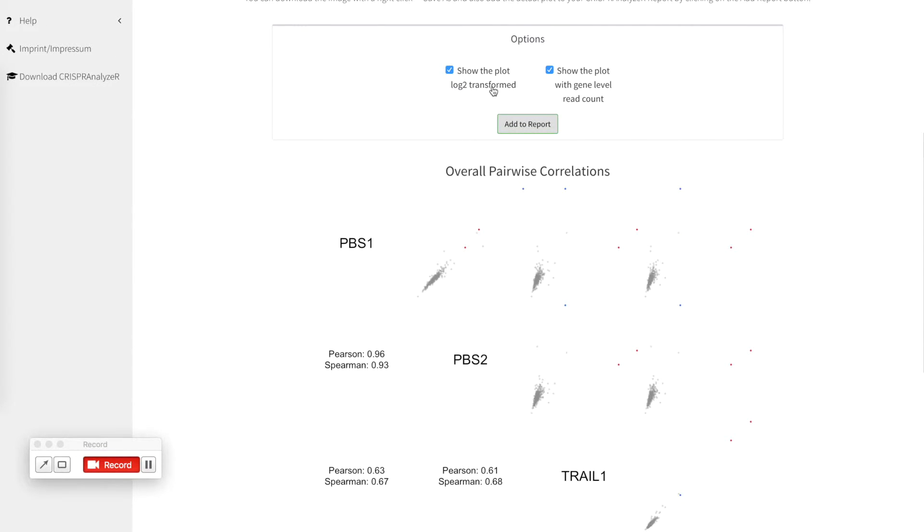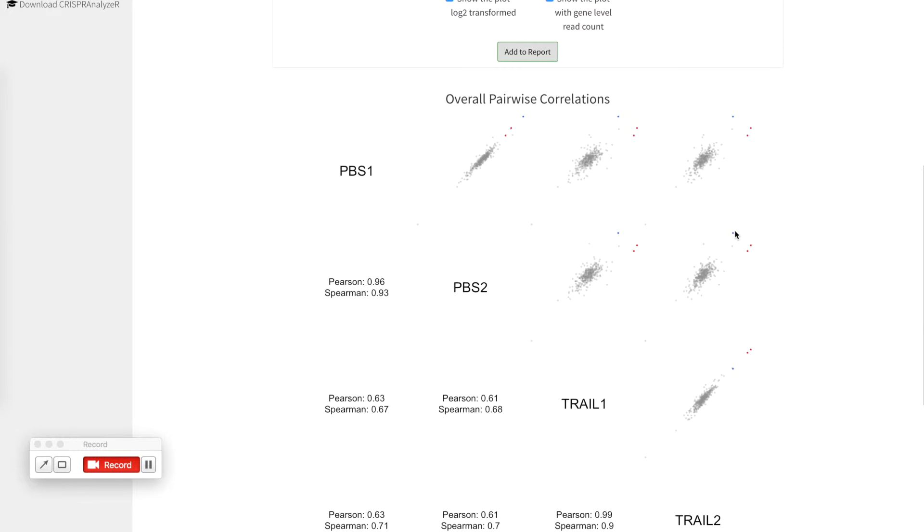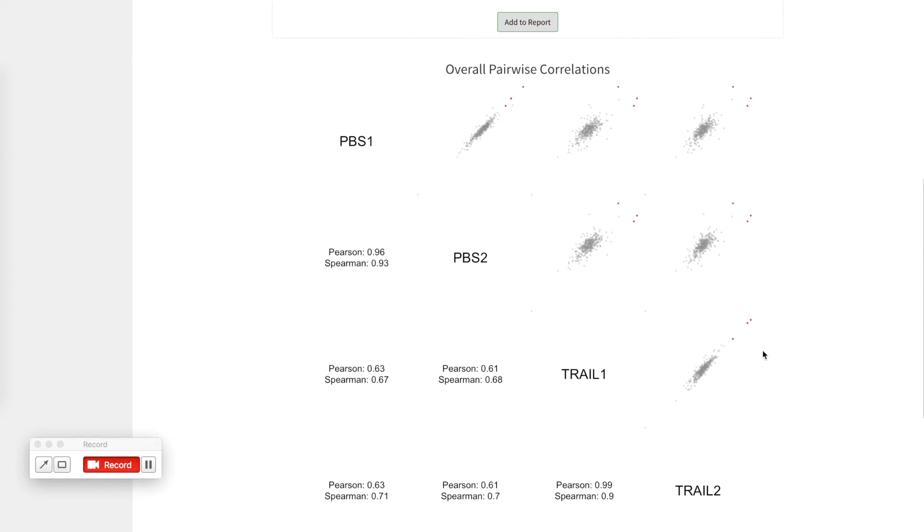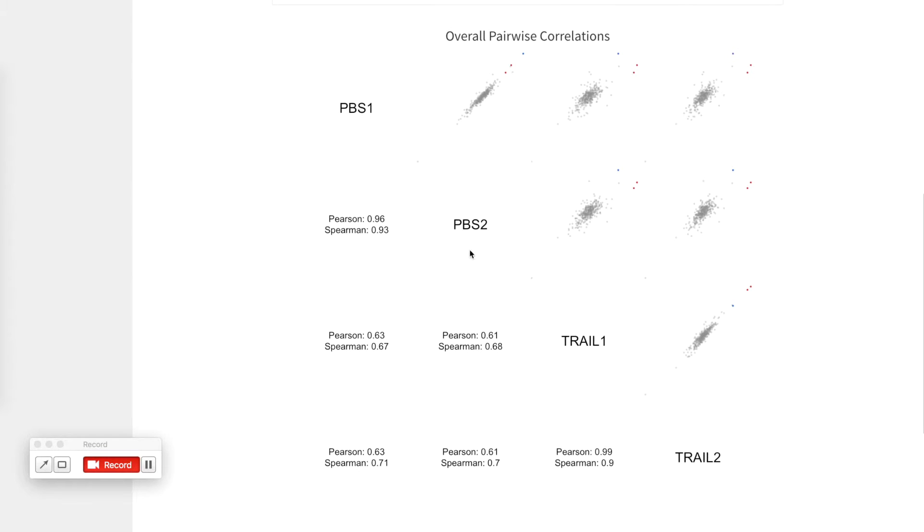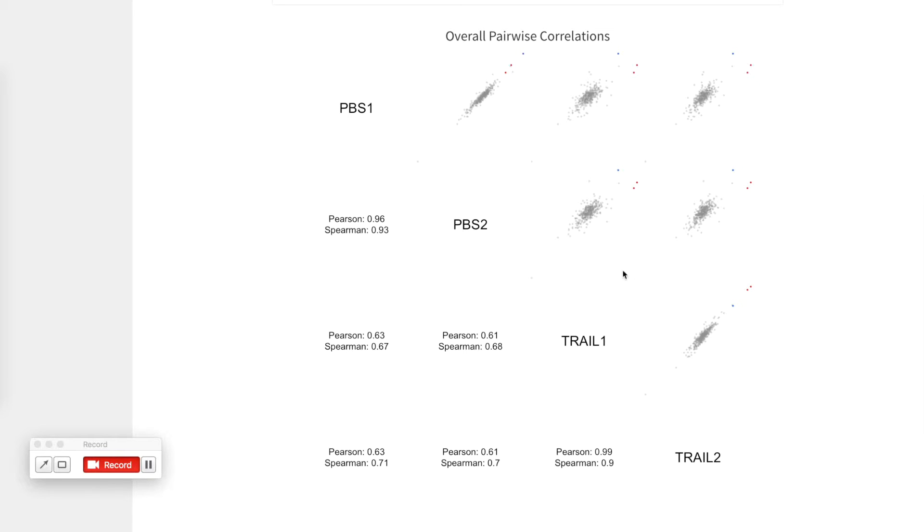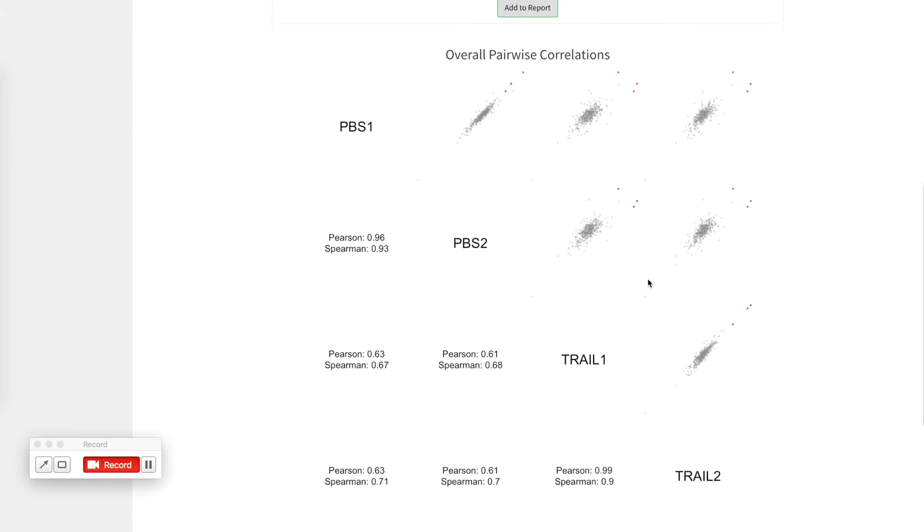You can also show this plot on a log2 transformation scale which is a bit more handy. Everything that is on the same diagonal is more or less exactly the same what is expected between the replicates, it's a bit more noisier between the treatments but it's a clear difference visible between the untreated samples and the treated samples with a clear tendency of the positive controls to show a higher read count in our treatment samples.